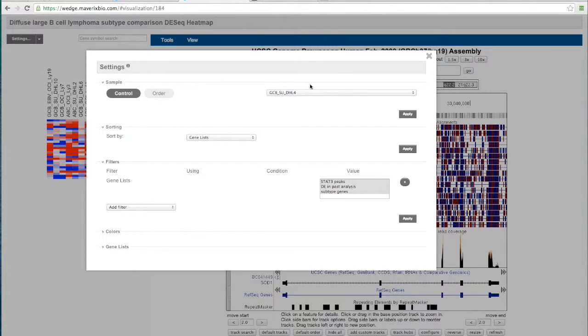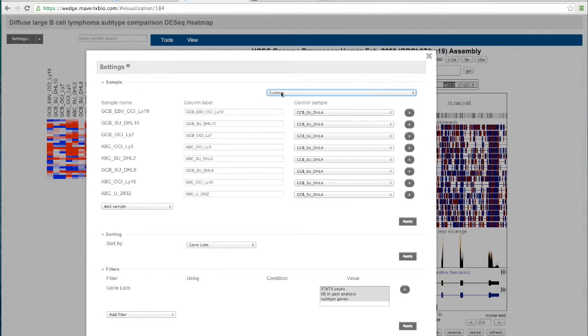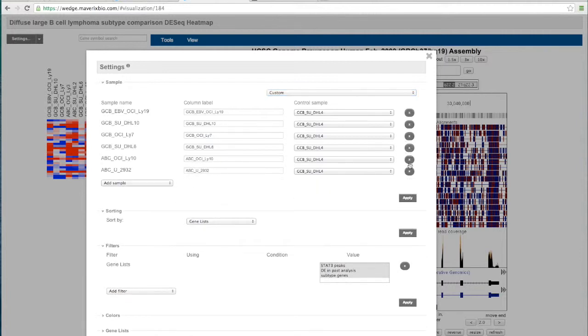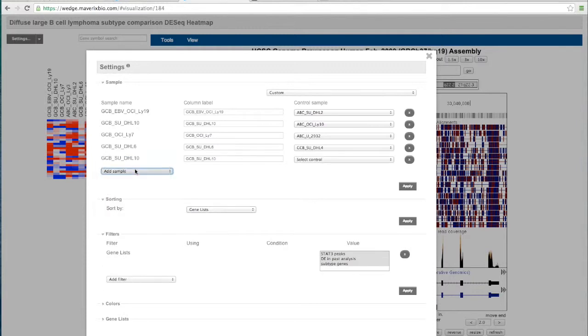One final thing, and this is the most customization that you can do here. If you click Custom in the sample pane here, what you can do is actually remove samples. You can add samples. Maybe I just want to look at this subset of samples. What I can do is select the reference or control sample that I want to use for each of those individually, so now they don't have to all use the same one. And I can even add samples if I wanted to look at one of these samples, and here I'm comparing it to this control or reference sample, and maybe I also want to see a row where I compare it to something else.